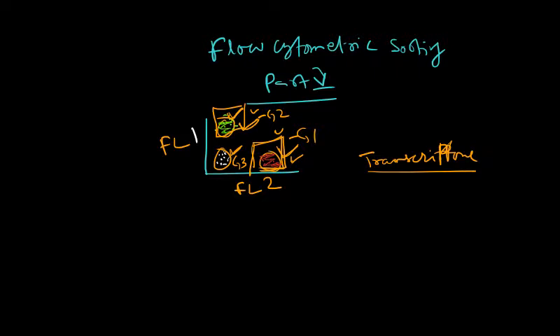But how does the instrument perform this sorting? How the instrument is performing this sorting, we'll talk about that. In order to sort, what is required for the sorter? We'll see a general structure or general anatomy of a sorter. So if we are talking about a sorter, the sorter is something like this. There is a flow cell, and the sample is injected into the flow cell. So there is a sample tube somewhere.